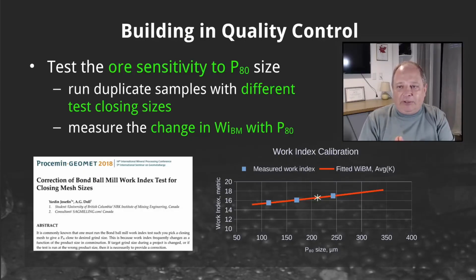So this is relatively common, but this is actually an ore characteristic that each ore can have its own shape of this curve. And part of what we want to see here is that there is a particular regression equation we expect these results to fit, and if they don't fit that, that's a hint that either you've got an ore that does something very unusual, or that there might be an issue in the lab test.